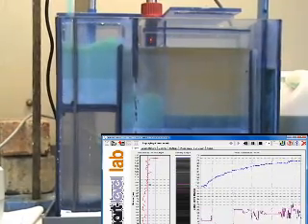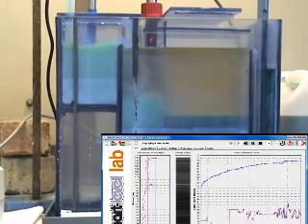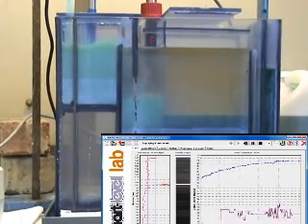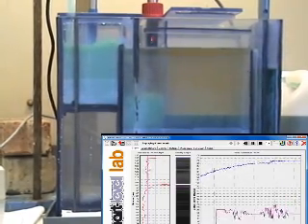Shortly we switch both pumps off and you will see the emulsion phase collapse and the levels decrease as shown on the Smart Level Lab software display.